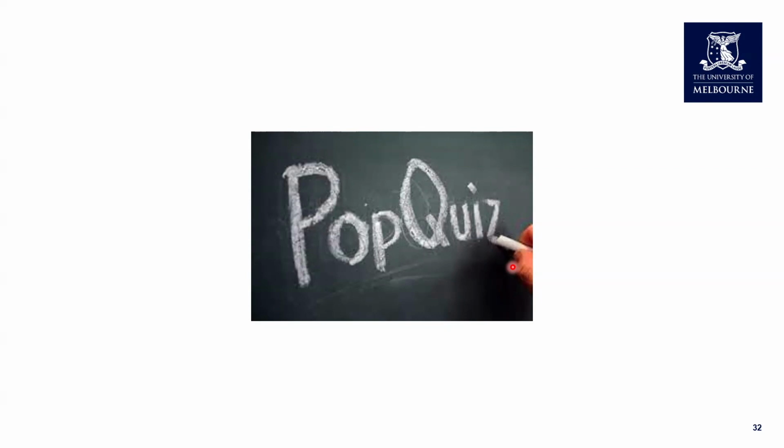Not many people have selected the bit depth, which is correct. Bit depth is kind of determined during the acquisition, so we can't really change it during the processing steps. And we can also increase the resolution, like I mentioned briefly just before, as a part of the deconvolution. But something I didn't mention because it was too much detail is that the image has to be acquired a certain way so that we can process the deconvolution to increase the resolution. So yes, the resolution is the right answer, but the image needs to be taken a very specific way.